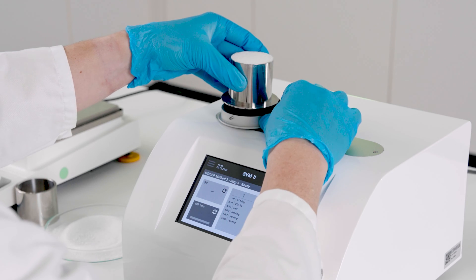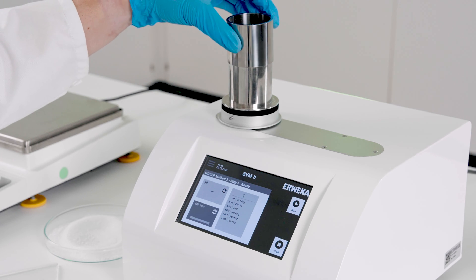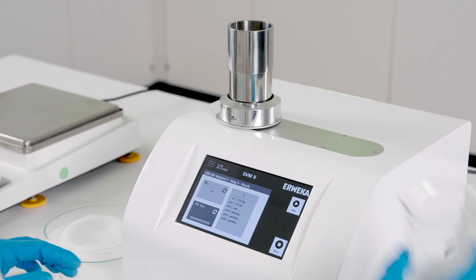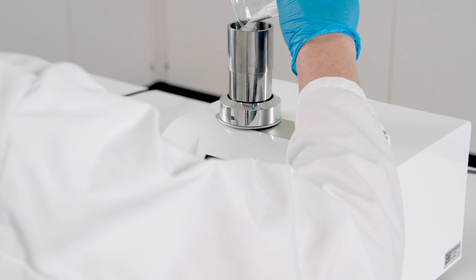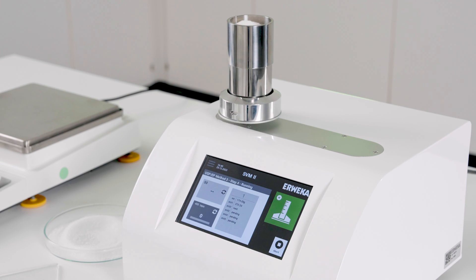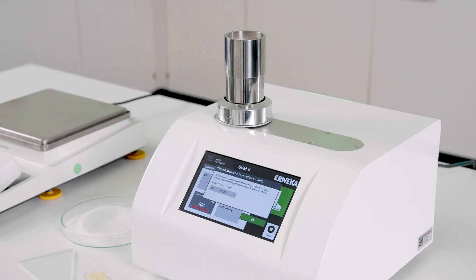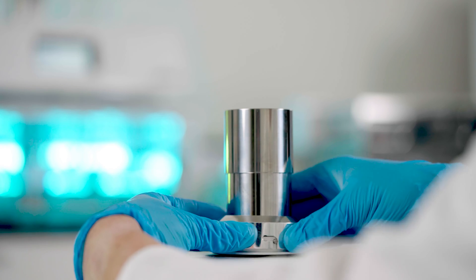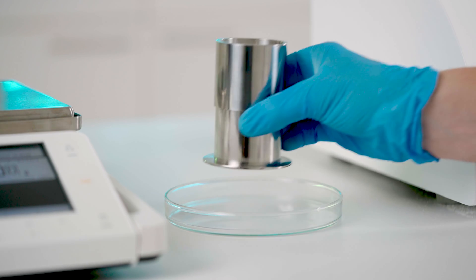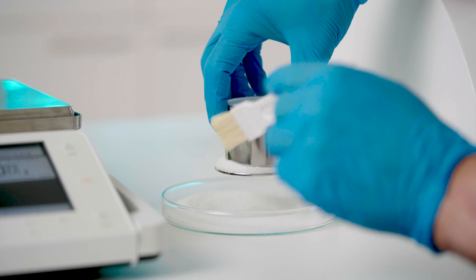Place the lid on the vessel again and overfill with powder once more. SVM2 now performs 400 taps. After the 400 taps are finished, remove the vessel and the lid again. Wipe off any excess powder and weigh again.